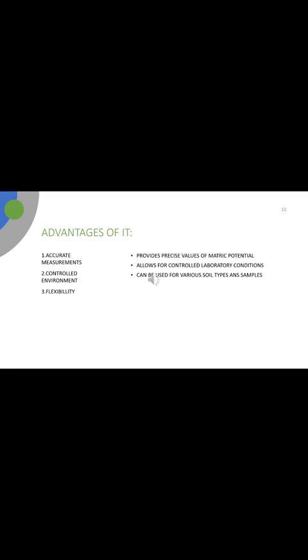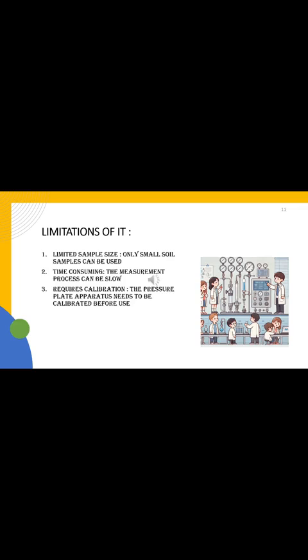Sample size: only small soil samples can be used. Time consuming: the measurement process can be slow. Requires calibration: the pressure plate apparatus needs to be calibrated before use. These are some limitations of the pressure plate apparatus.